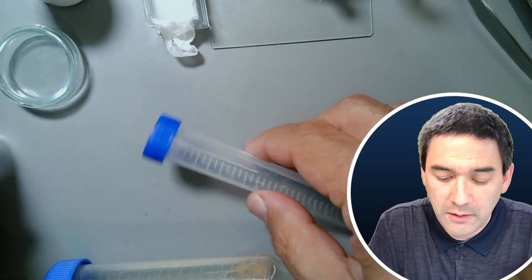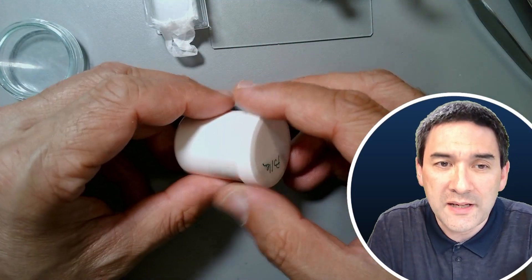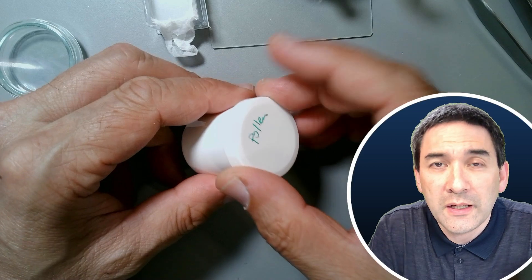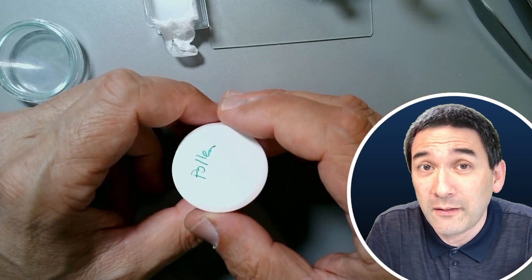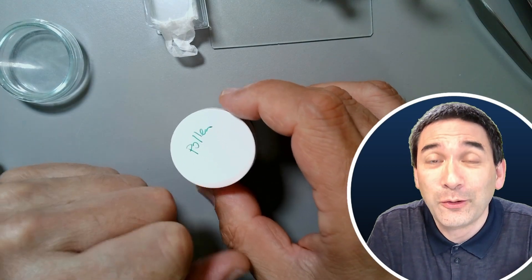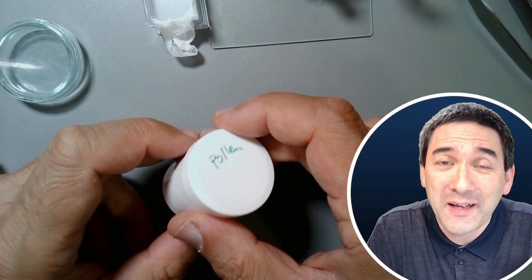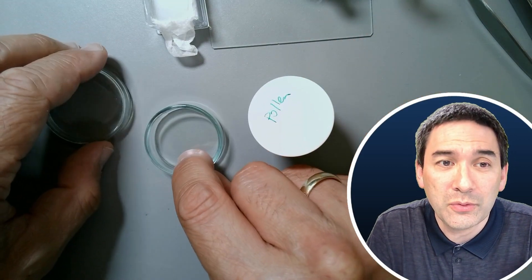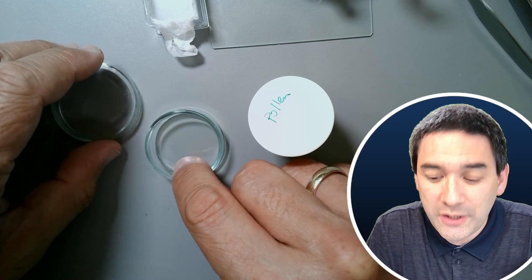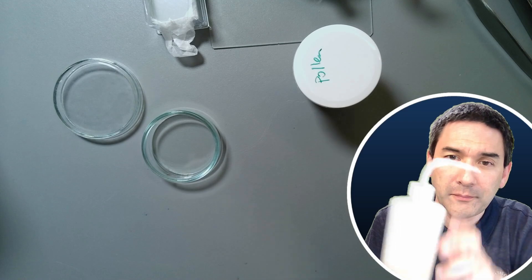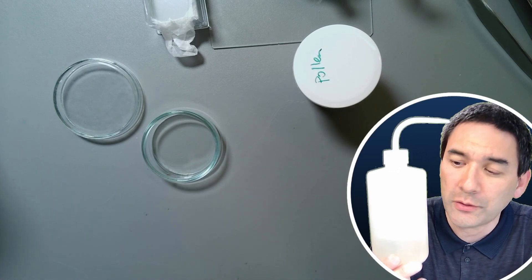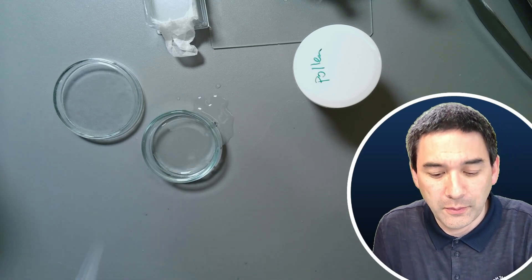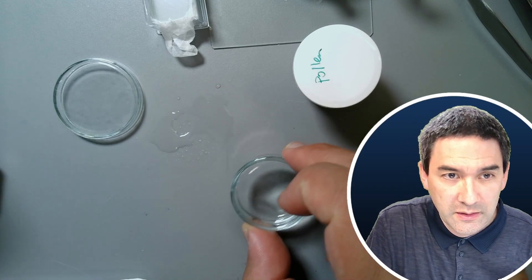If you do not like those, you can also get some other plastic containers. I labeled this one pollen, so there are pollen grains in here. It's still possible to buy old film canisters from back in the day of analog film. They are also quite useful if you're able to get hold of them. This here is also quite nice, a small petri dish. What I usually do is put a little bit of water in here. This is a water bottle because I do not have running water in my room. I fill it up, then I squeeze it and I'm able to fill it with water.